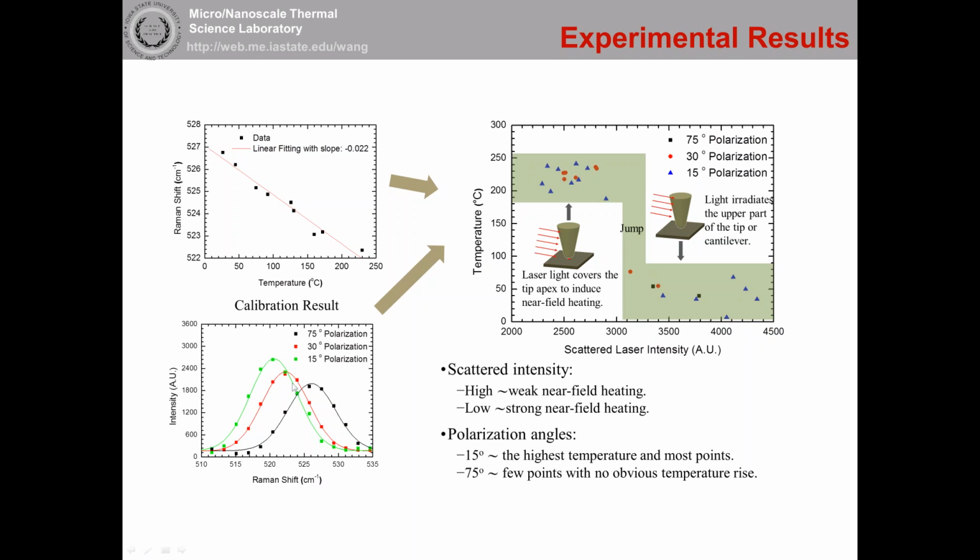So we measure the temperature from this peak, and the AFM tip is for the substrate. Because it's the first time we are measuring this temperature, basically the first time people can measure temperature with a near field AFM tip, which is very challenging, we try to make sure our result is good and reliable.